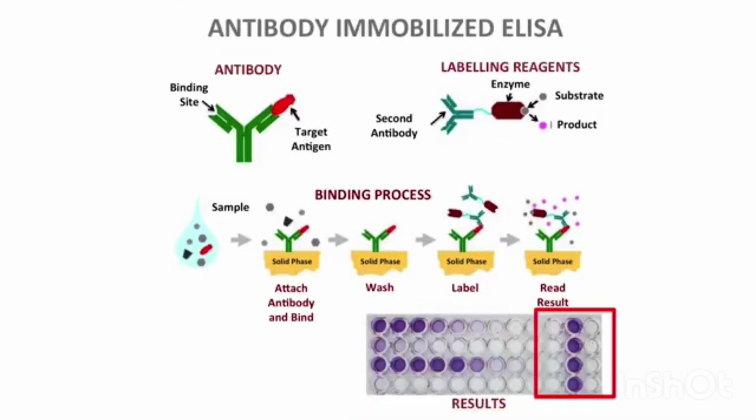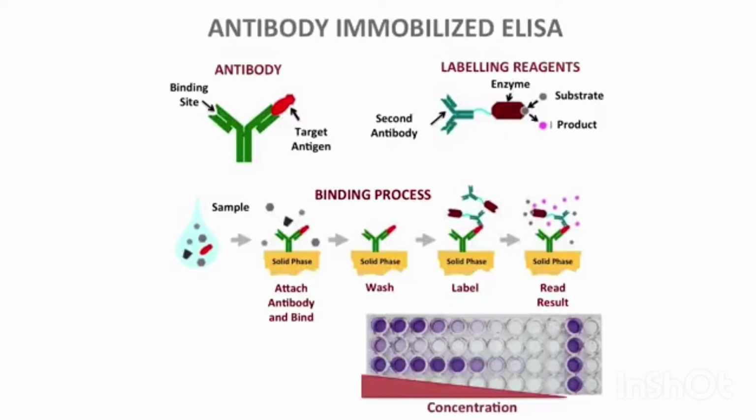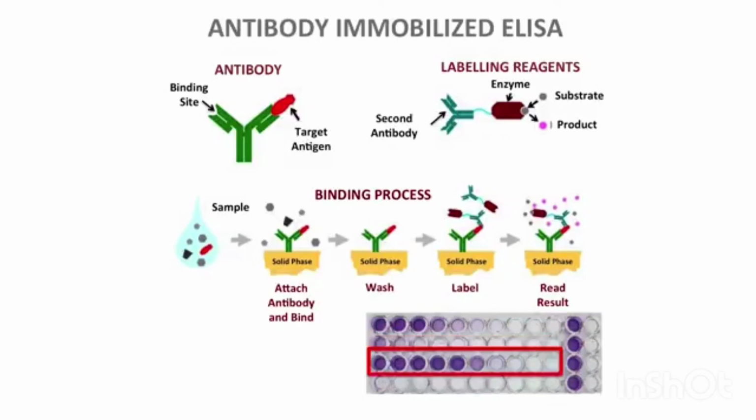And on the right you see controls for each of the rows, and on the left the results from different samples. And you can see by doing dilutions of the sample, you can get some sensitivity about how much of the antigen is present. And in the bottom row there isn't any. In the second row it's not so much. There's more in the first row and a lot more in the third row. And this can give you a measure of concentration. Sometimes it's just a yes or no. Can you detect it at this level or not? Other times you want to know the concentration, depending on the particular application.